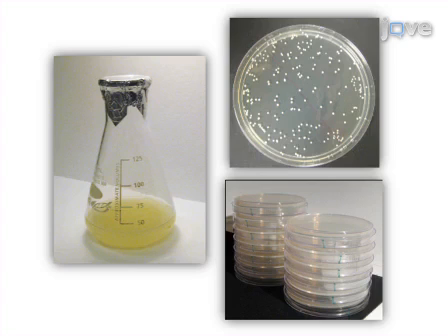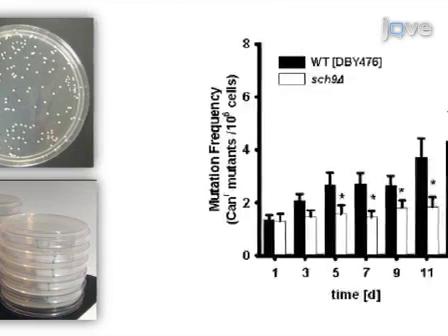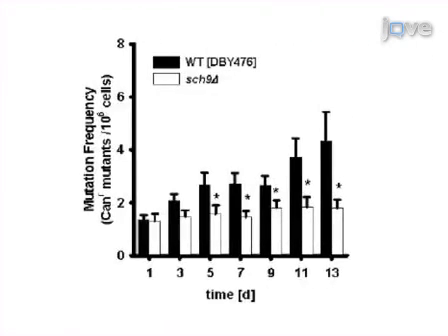The next step of the procedure is to examine the DNA mutations by sampling aging cultures and plating cells on mutation-specific selection medium. Ultimately, results can be obtained that show changes in DNA mutations during yeast chronological aging through normalizing the mutation assay results to the viability. This method can help answer key questions in the aging field, such as the mechanisms that link aging and genomic instability in higher eukaryotes.